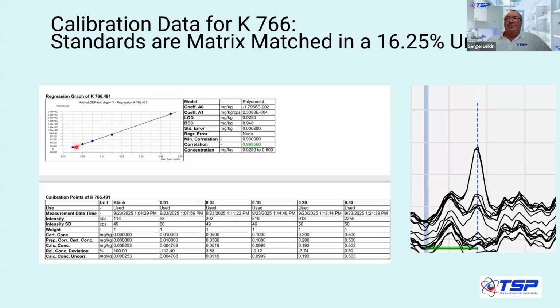So your detection limit here is probably somewhere around 25 ppb, probably quantifiable like that. That is the effect of getting additional gas, on top of being able to run it reliably. Yeah, that's the point here.